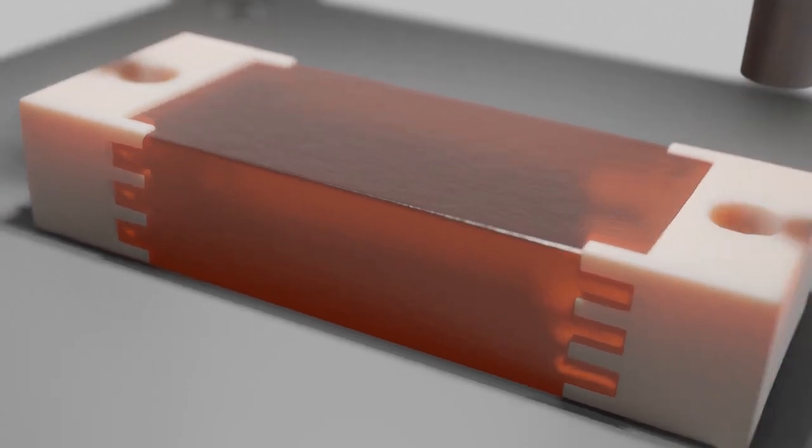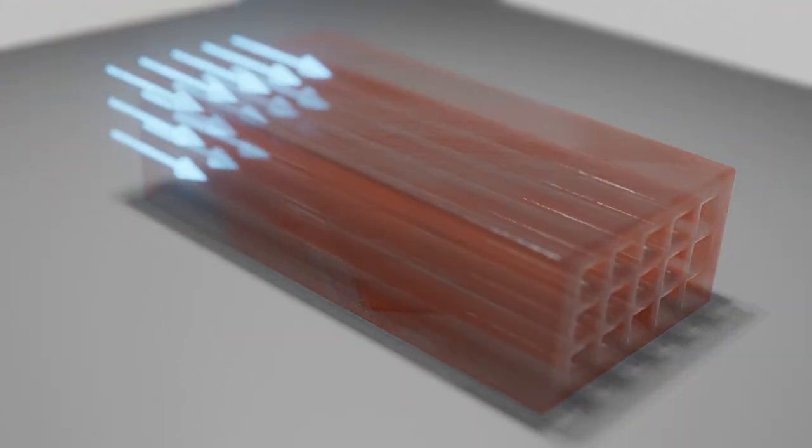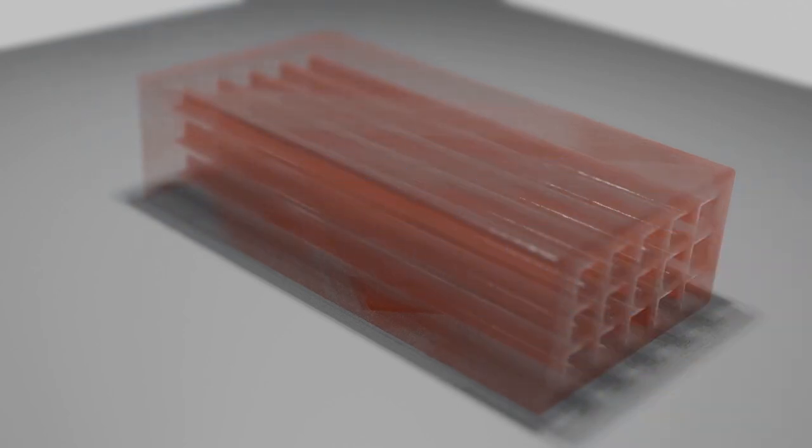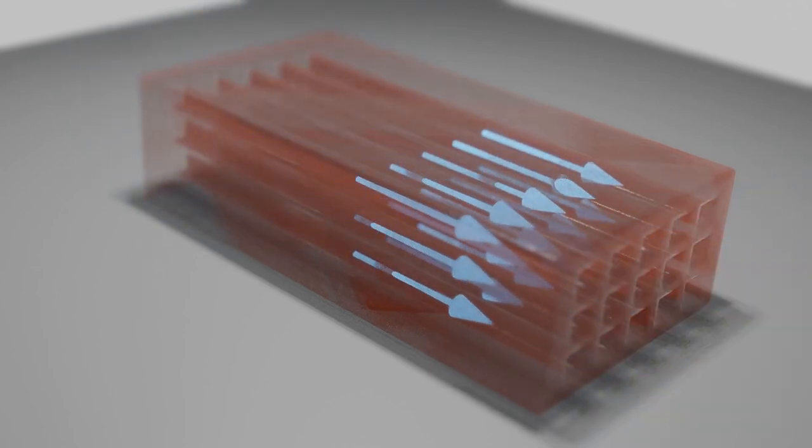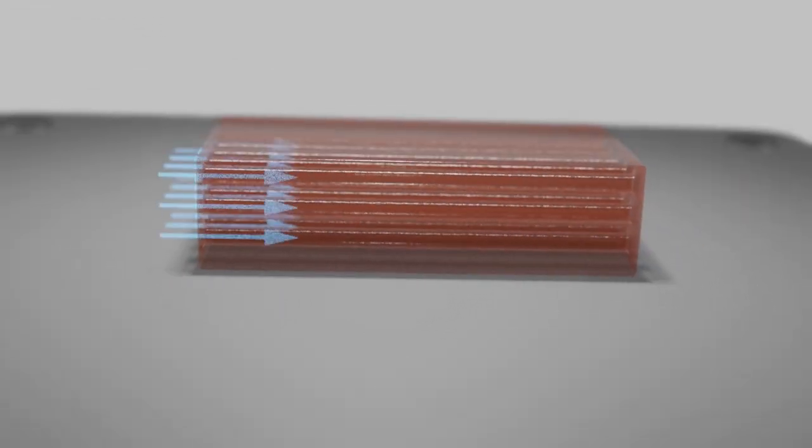A network of channels aligned with the fiber direction can support cell viability by allowing for liquid perfusion through all the tissue volume without disrupting the muscle fiber structure. However, the positioning of the anchors obstructs the perfusion network.